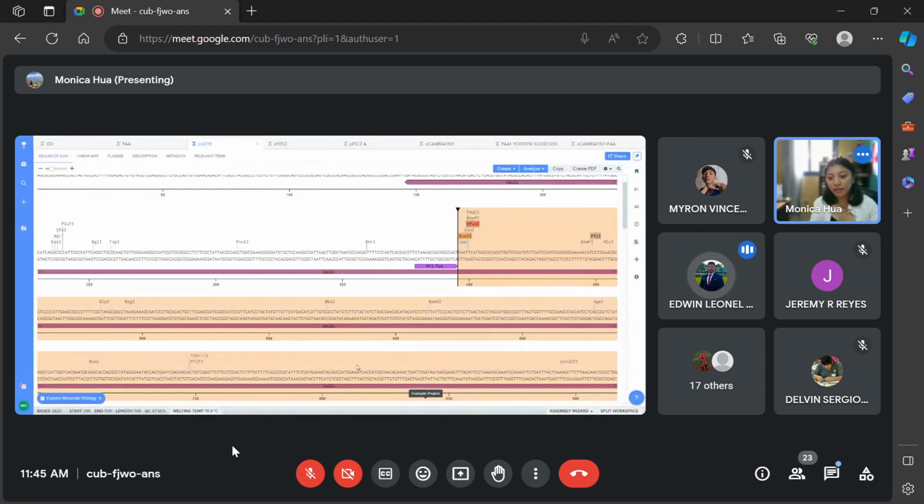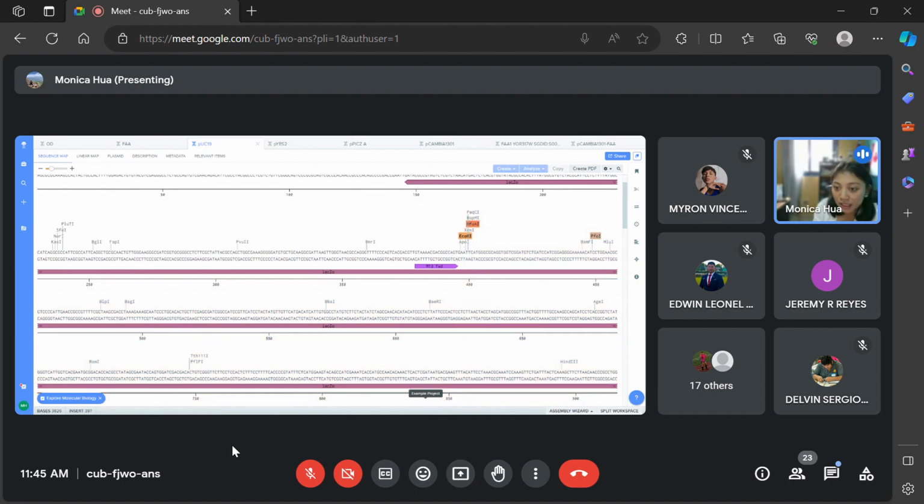You should select the option that says cut bases, delete bases. For example, you will select the EcoR1 site, or whichever restriction enzyme site, and you just press backspace, just delete. It should ask you to delete, and you delete that. And in its place, you will enter your sequence. Okay, so try that.